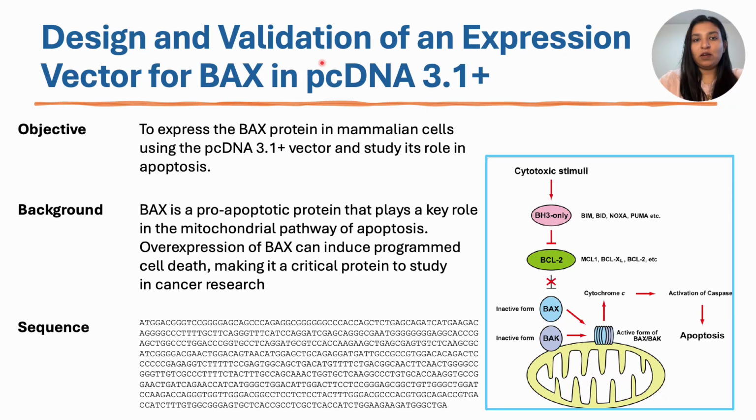Hello everyone, today I will be presenting my project, which will focus on cloning the BAX gene into pcDNA 3.1 plasmid and validating its expression in mammalian cells. Now let me briefly explain the function of the BAX gene.